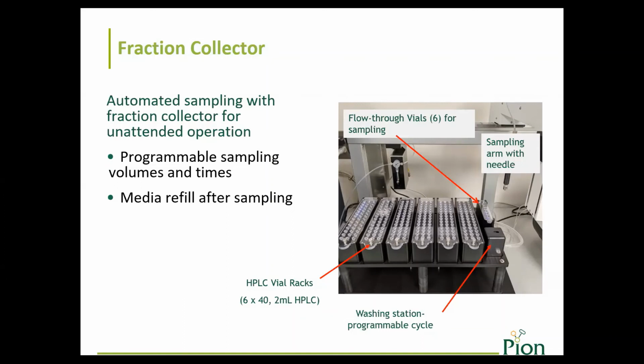One thing I'll point out, and we'll resolve this, is that each SCISSOR chamber has its own 40 vial rack. So you'll notice that we have 6 HPLC vials here. I'll talk about that in a minute. But you can have a total of 40 samples from each assay on the SCISSOR N3. Next, please.